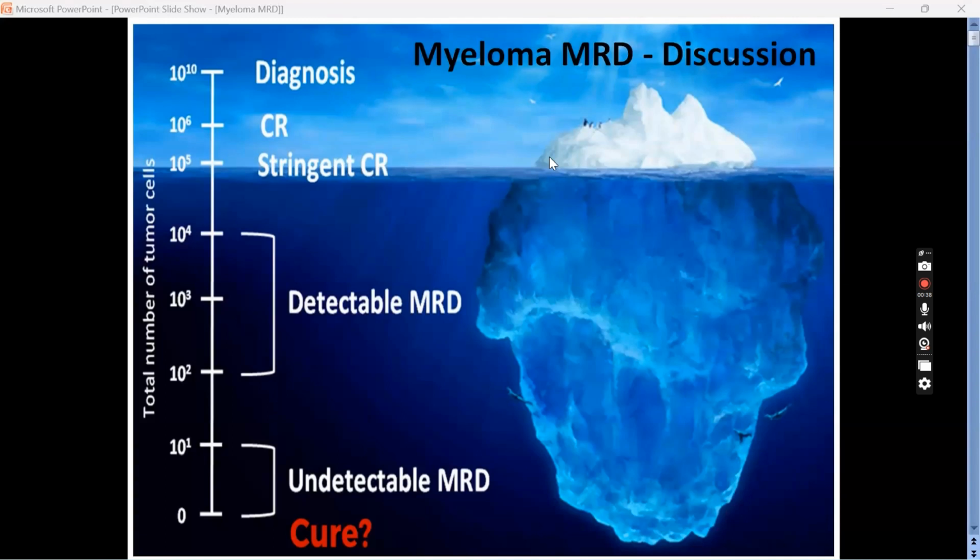So that's the plan, and we can quickly see two myeloma MRD cases with live analysis, because I want to reserve tomorrow for MDS. Tomorrow we can go through MDS and see one or two cases of how flow could be useful. So today I want to finish off the myeloma MRD discussion, along with establishing the sensitivity of an MRD assay with experiments like LOB, LOD, LOQ, and live analysis of two myeloma cases. And tomorrow we'll deal with MDS.